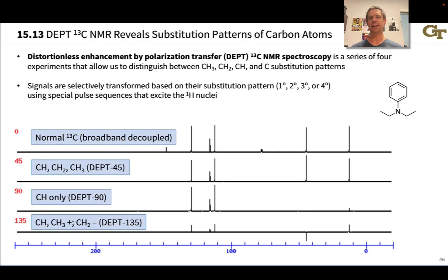From a carbon-13 NMR spectrum we can get information about the numbers of distinct sets of chemically inequivalent carbons in the molecule, as well as some information about functional groups using chemical shift ranges and a carbon-13 correlation chart.